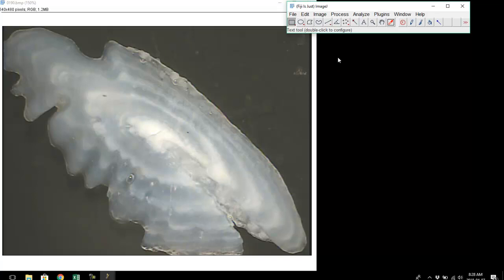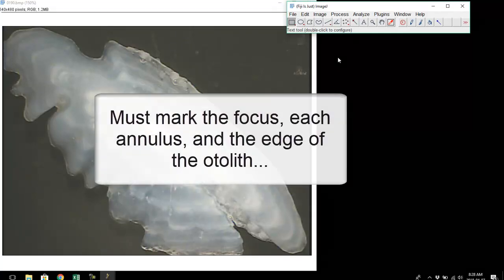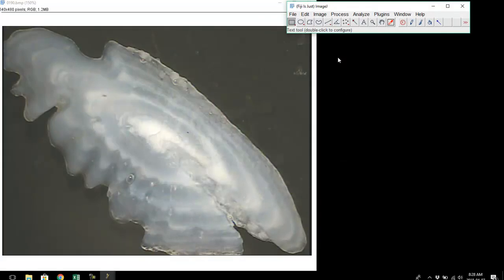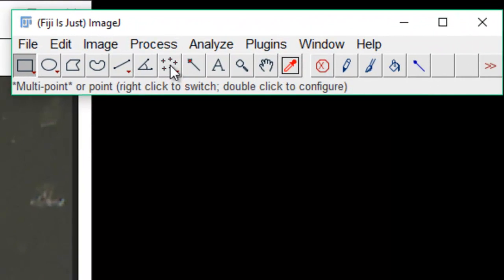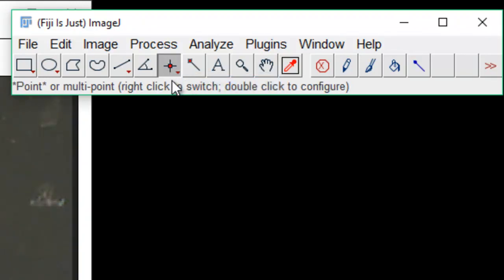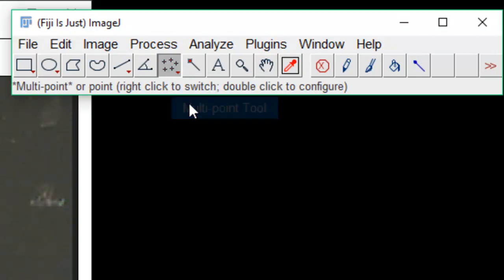Now I need to mark the focus, every annulus, and the edge of the otolith. Since I need to mark multiple things simultaneously, I'm going to use the multipoint tool. You may have the single point tool — if you right click, you can change to the point tool, which will only mark a single point. If you want to mark multiple points, right click and go to the multipoint tool.